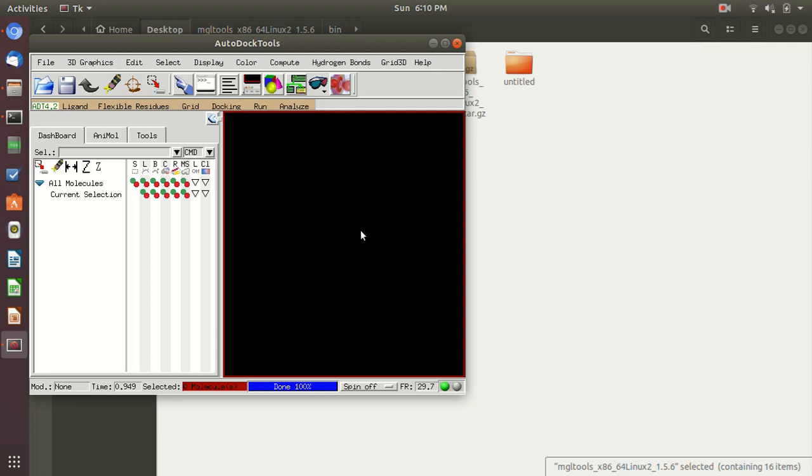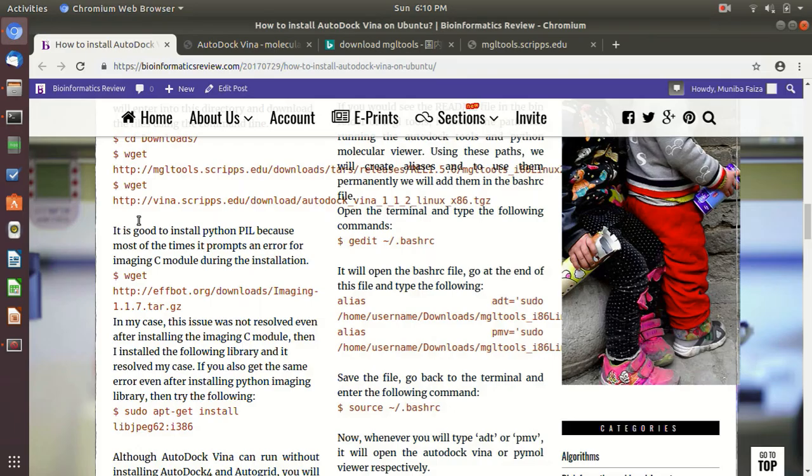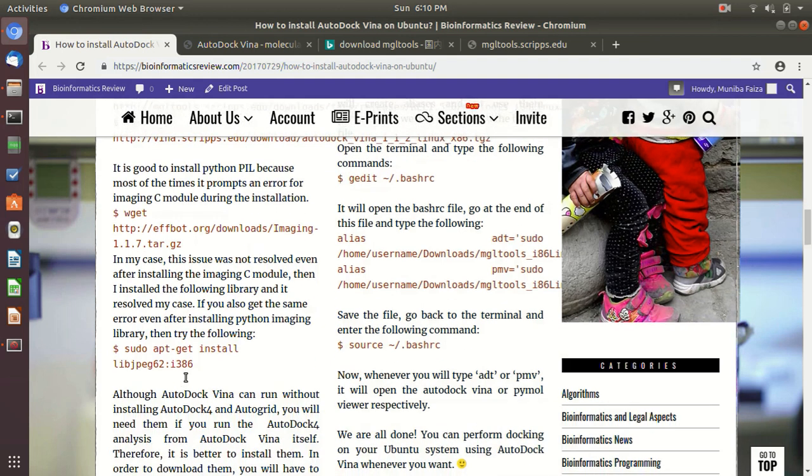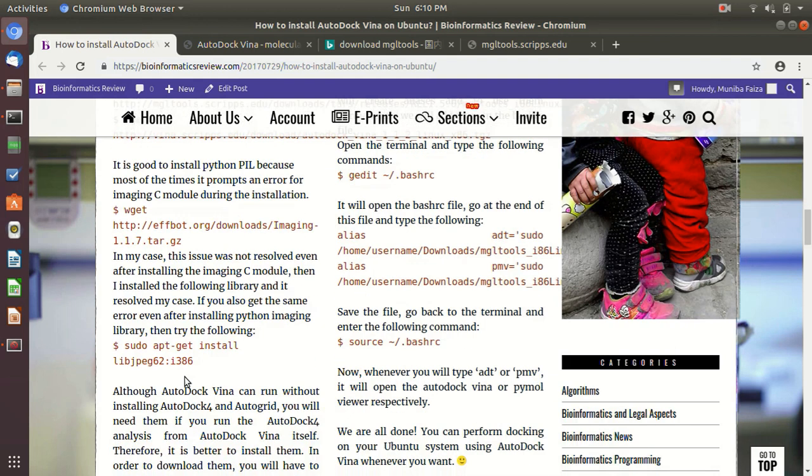And the next thing is, don't mess up with the pathways. And when you are creating aliases, remember the alias. And also, as I told you, install this image library.